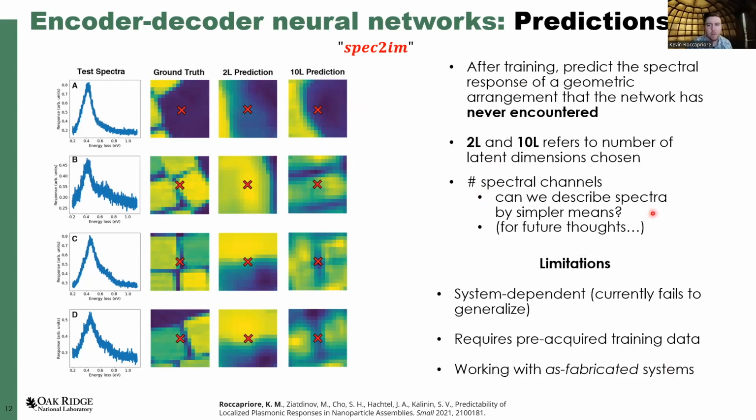One of the things when we do this, you'll notice that this is an energy axis here, and it looks like these are kind of noisy spectra. These were acquired a few years back on a traditional scintillator-based detector, and so there's a bit of noise in here. Typically, the number of spectral channels here, if we include the low loss peak, which is actually cut off and subtracted off, the total number of pixels in the energy axis is almost like 2,000.